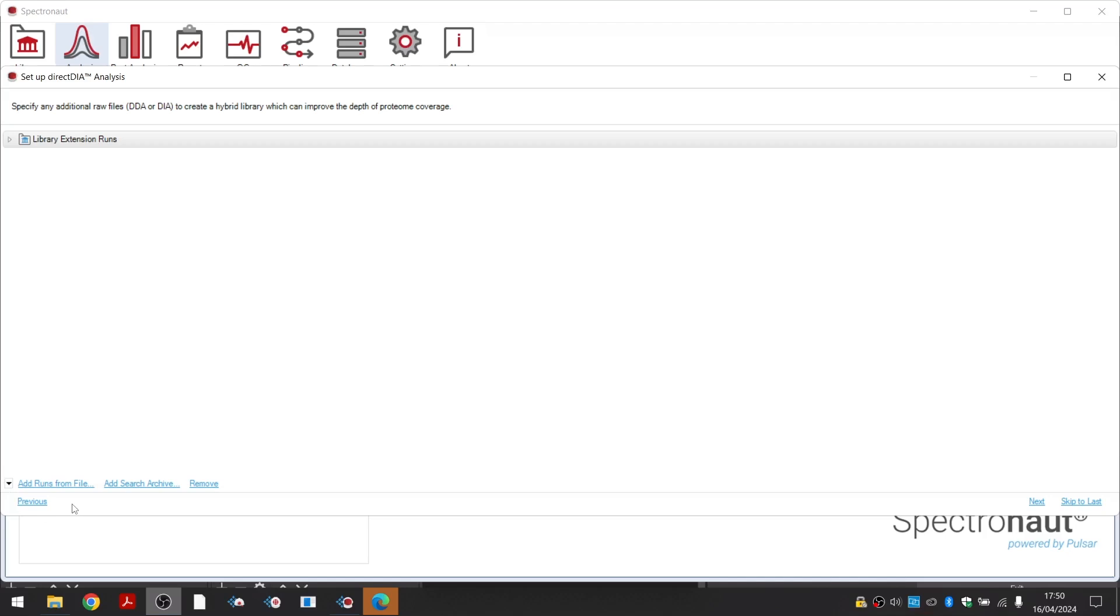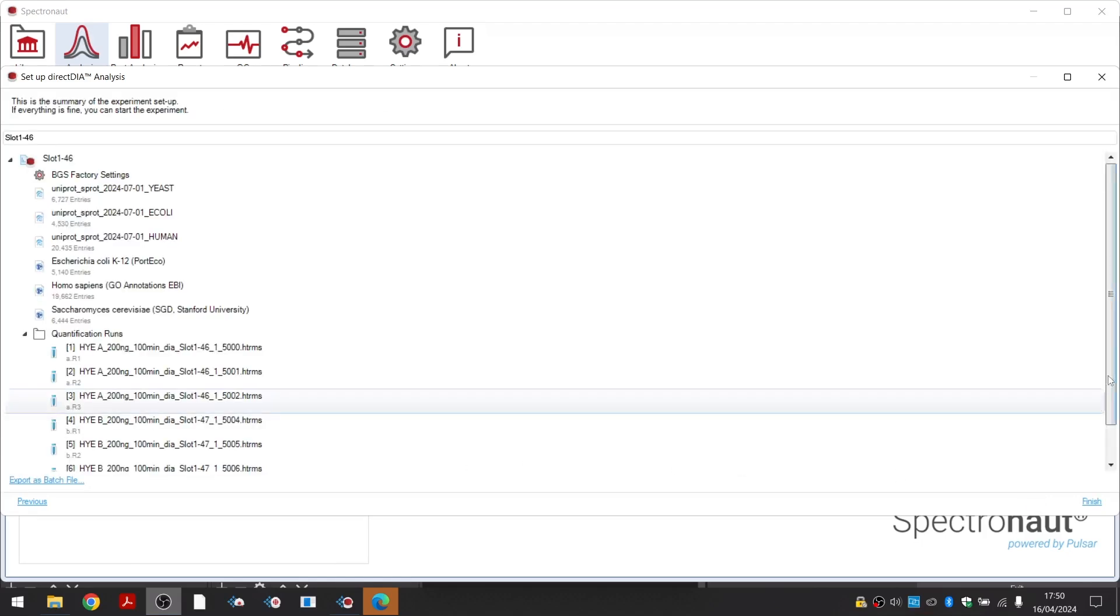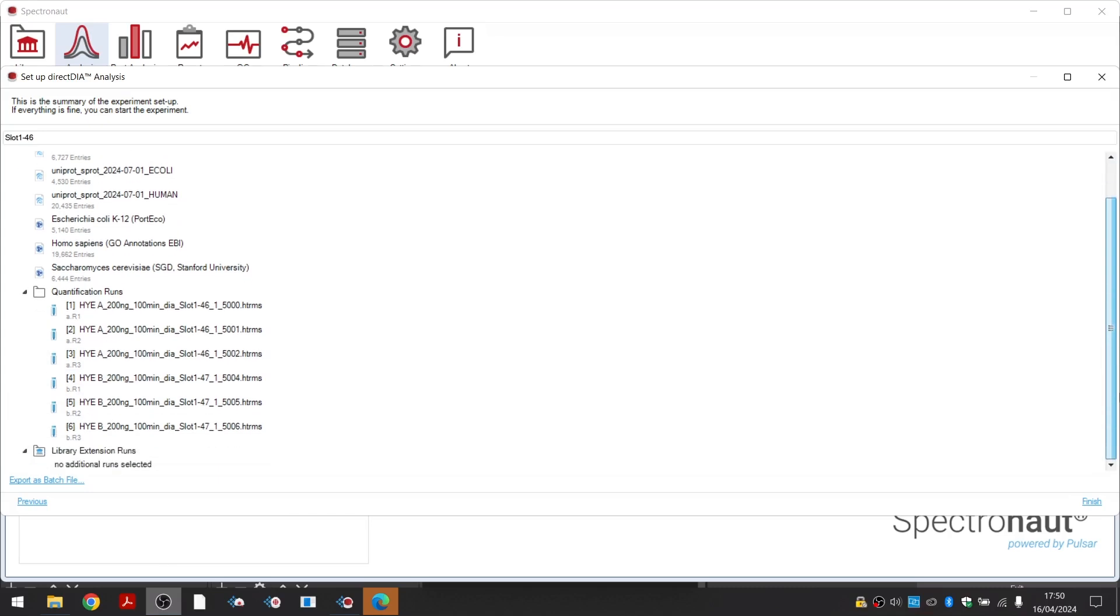If you have already processed DIA or DDA data of the same sample type using Pulsar, you can use search archives of those searches instead of the raw files. This helps to reduce additional analysis time. The last page shows an overview of the whole experiment setup. Clicking Finish will start processing your data.